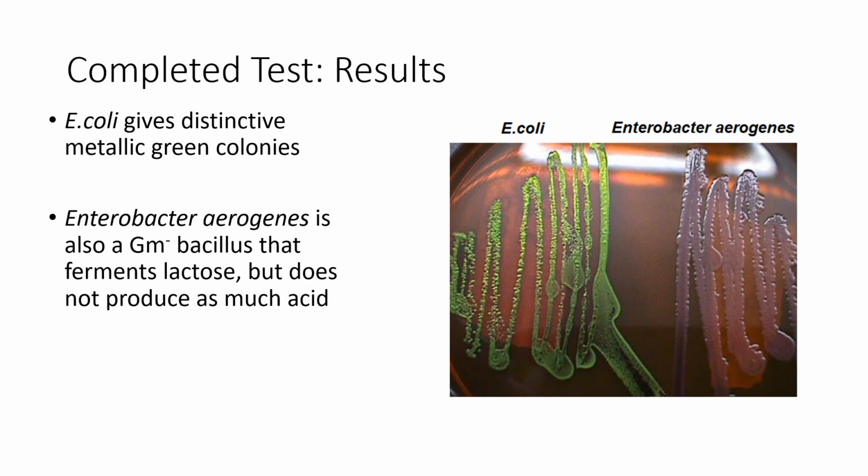Other organisms don't. And the typical other organism that you might find is Enterobacter aerogenes. Now, Enterobacter aerogenes is one of the 8 organisms that I would have given you in the unknown. And this reaction on EMB is something to take note of because you might get as your unknown EA, Enterobacter aerogenes, which would have passed all the way through the coliform analysis, but here, it's not E. coli, right? It's different, but it is a result that we can work with and we can remember.